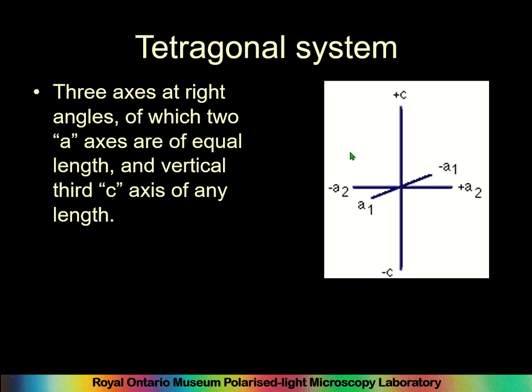And either I or Professor Sunahara will come over and say, no, that isn't. You're looking down at another mineral down the c-axis. Because you imagine, if this is a mineral with the shape of a mineral, it'll be longer in this way, and it may be oriented in the thin section so that what you're doing is looking down the c-axis.